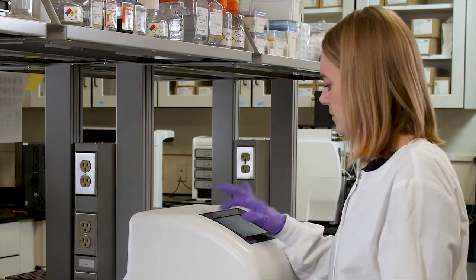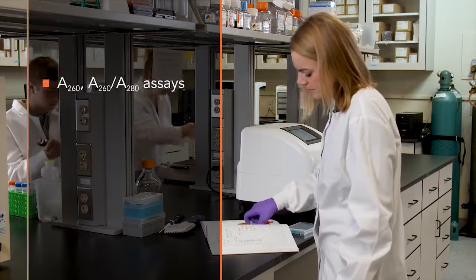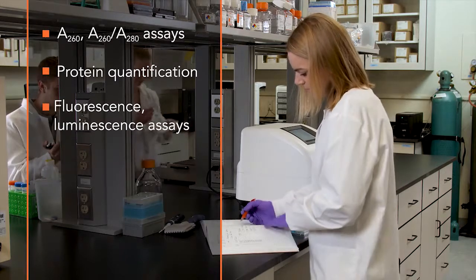Built for simplicity and performance, this compact instrument runs the most common endpoint microplate assays.